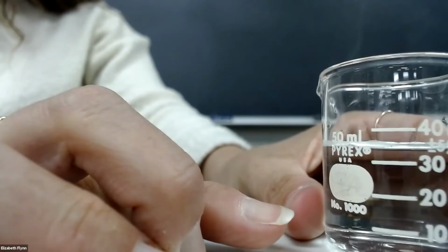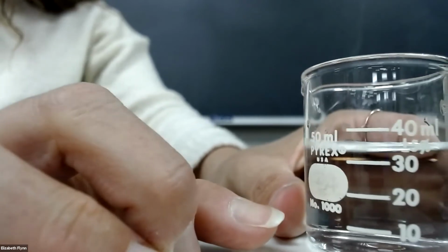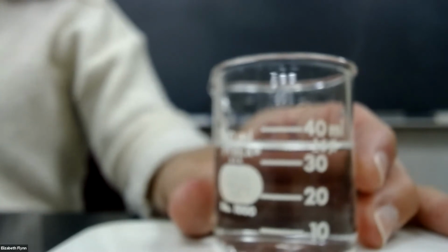That's nice and sharp right there. Okay, we'll say 35 milliliters for that measurement. 35 milliliters. What I'll do is show you after we're done taking all the measurements down, make sure you write them down, but I'll show you my template from my lab notebook online when we're done. All right, so 35 milliliters for the 50 milliliter beaker.